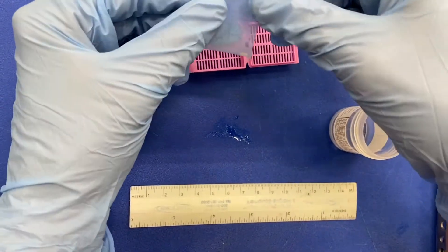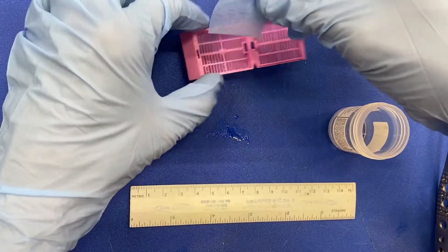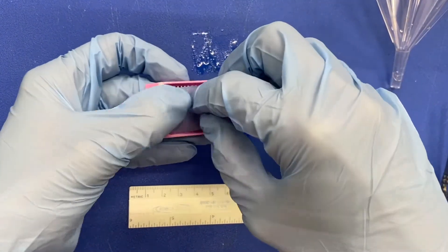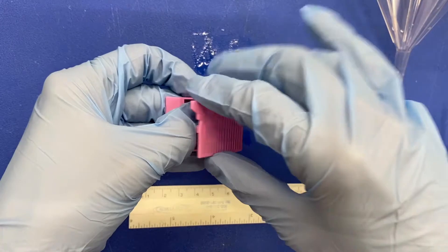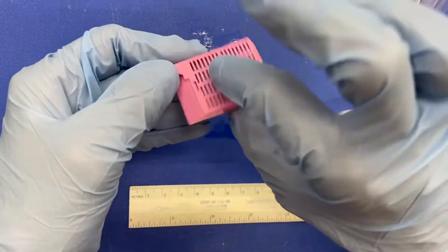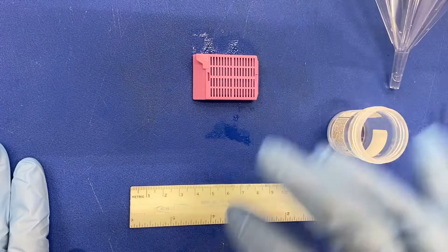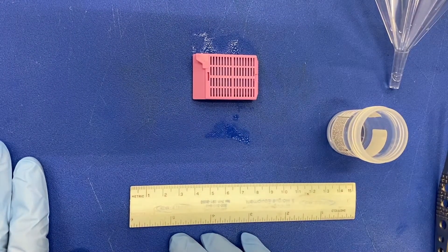Measure your specimen, place the biopsy bag into the cassette, making sure to fold it carefully so that the cassette lid closes completely. You will then place your cassette in formalin and move on to your next case.